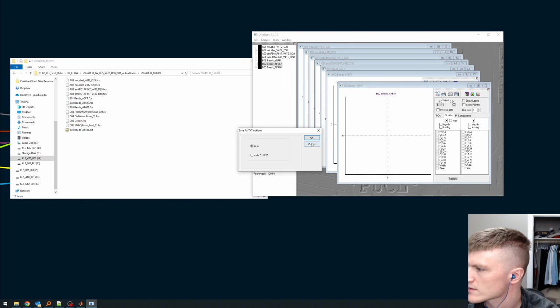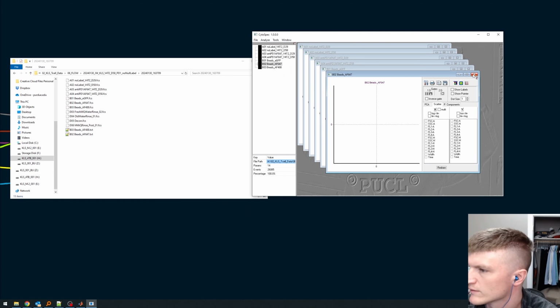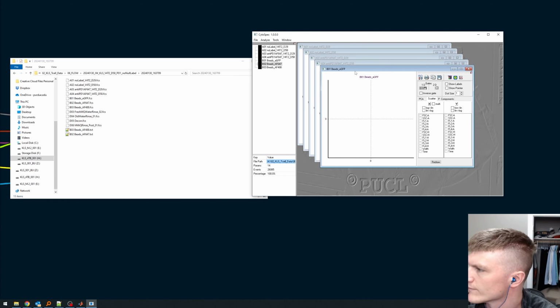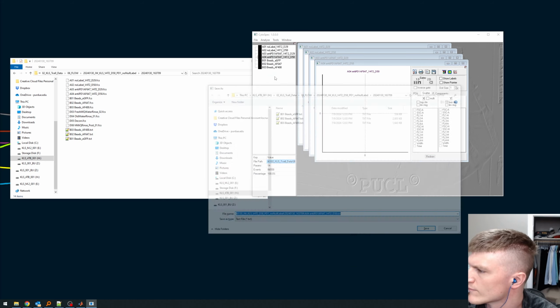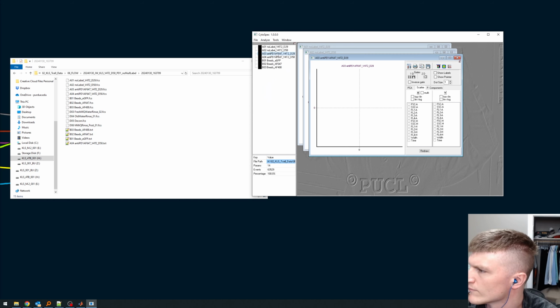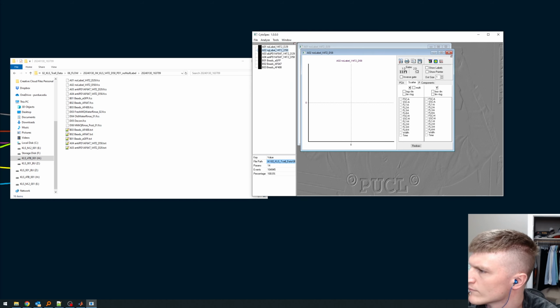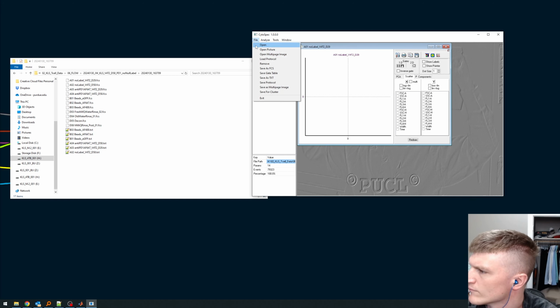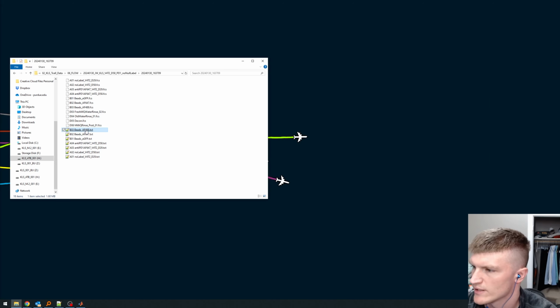File, save as text, and we're going to repeat that process.